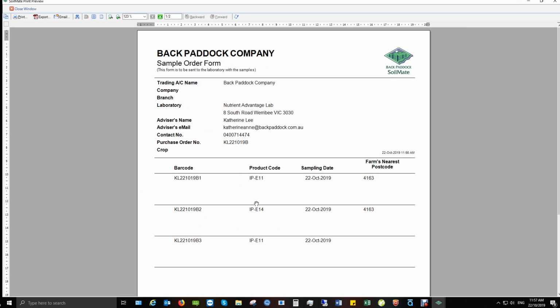So if your samples are slightly moist, I'd recommend putting this paperwork in a zippy bag so it gets there safely. Make sure all your samples are contained. So if there's leaking in any way, if they're very just dusty and dry, or if they're moist, probably rebag them in a zippy bag independently as well. So you want to make sure that your samples get to the lab safely so you're not losing any time in having to resubmit.